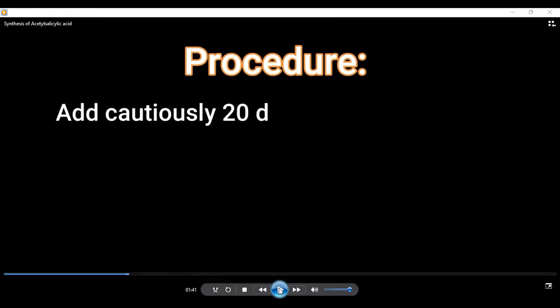During boiling the Erlenmeyer flask moves, so it is not stable in a flat position. So I needed to hold it.